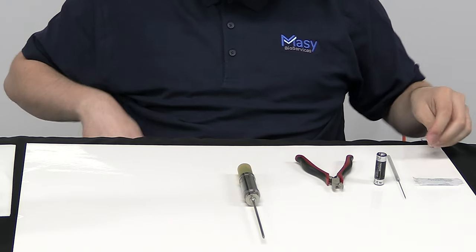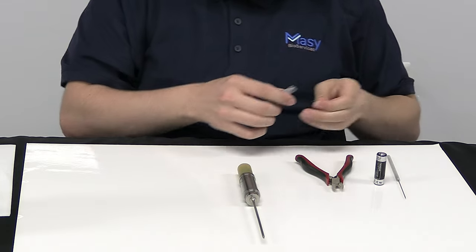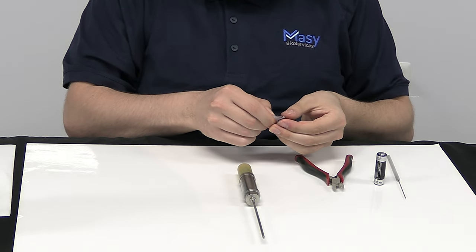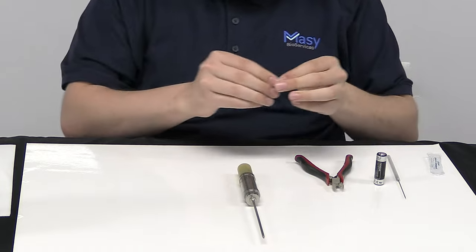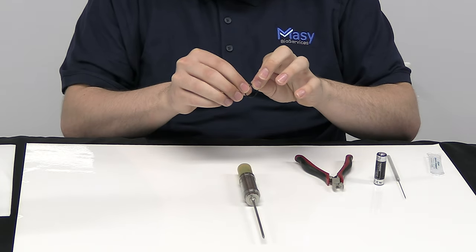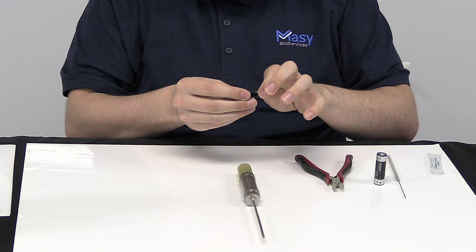We start by taking the silicone grease and the rubber o-ring and ensuring the gasket is greased nicely. So we take a little dot and run it through between our fingers.